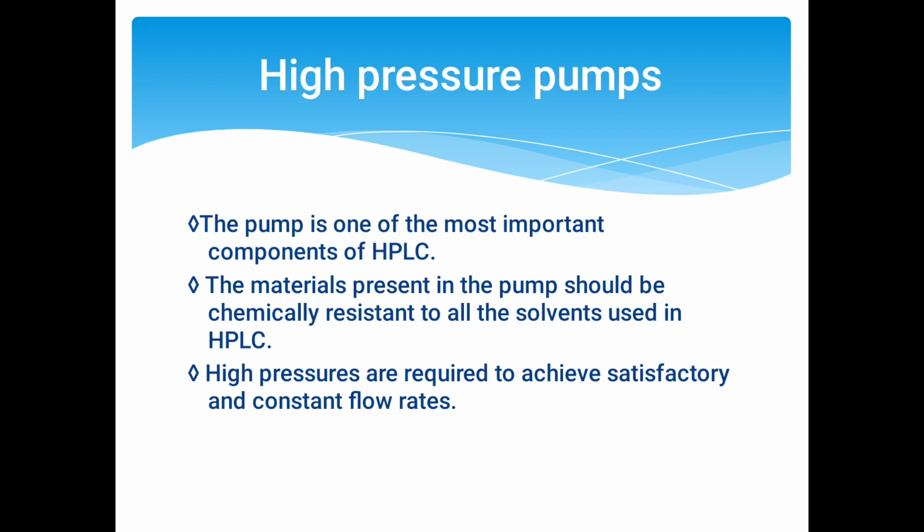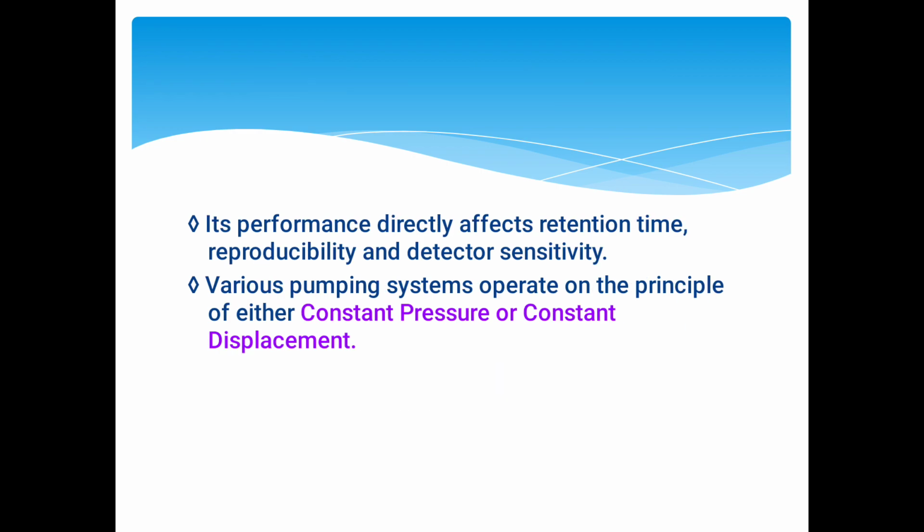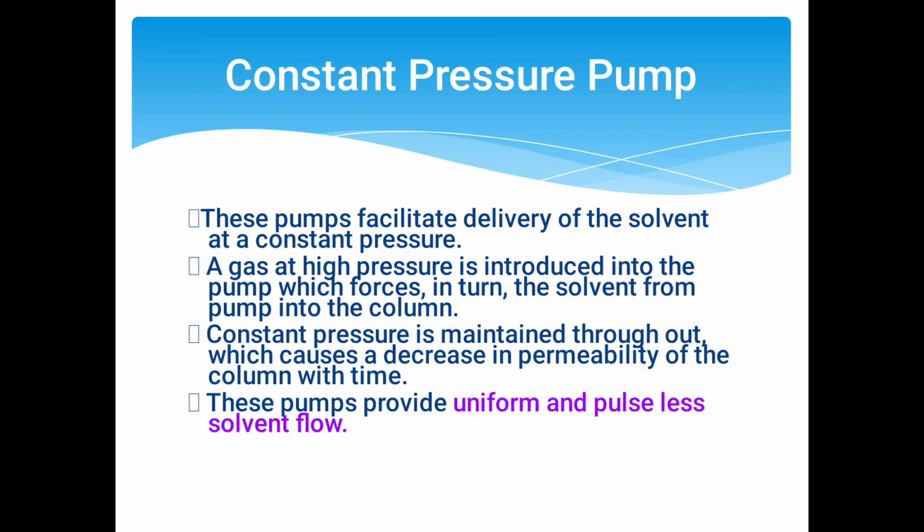High pressure pumps. The pump is one of the most important components of HPLC. It should be chemically inert. High pressures are required. Its performance directly affects retention time, reproducibility and detector sensitivity. Various pumping systems operate on the principle of either constant pressure or constant displacement.